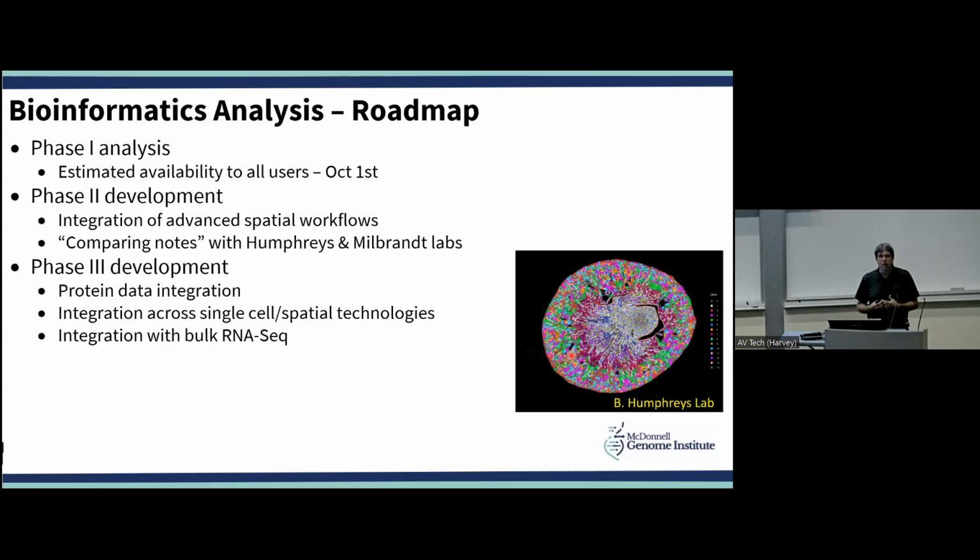Because as you probably know, with all of the single cell and spatial work, you generally don't see all the transcripts present. There are limitations, especially with droplet technologies. If you run single cell analysis on something, you might get 5,000 or 6,000 transcripts. We know that if we do things like FACT-seq or SMART-seq, you can see 12,000 transcripts in those same cells if you sequence deep enough.